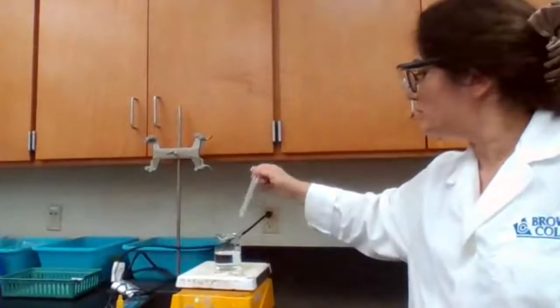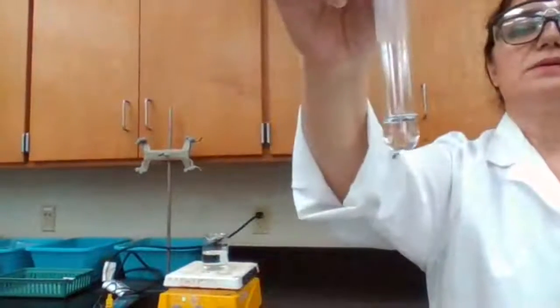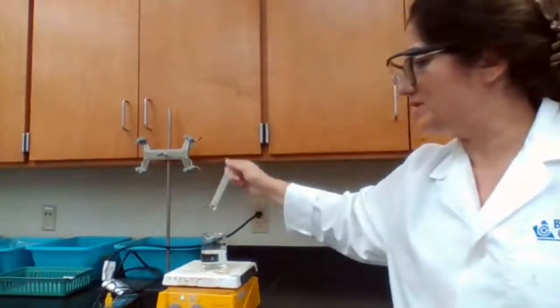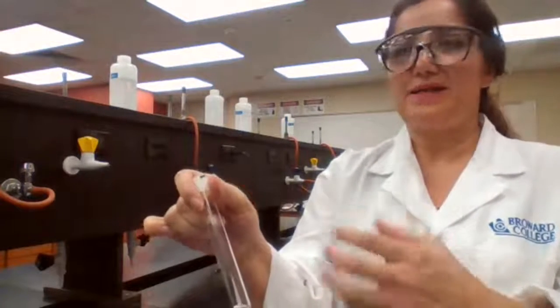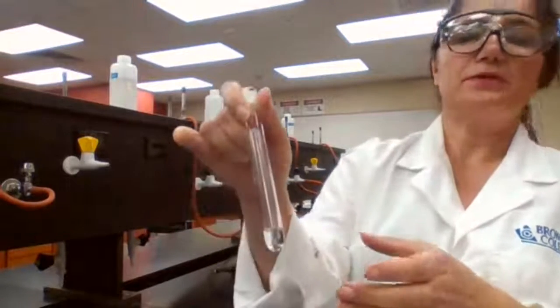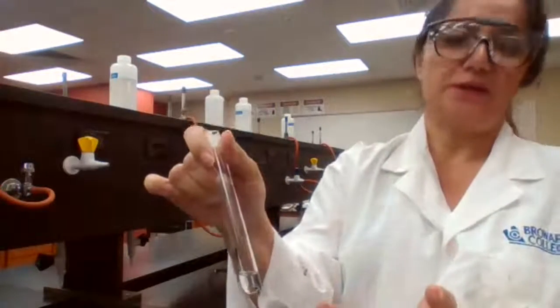it changed to a clear solution. So in the hot water bath, it changed to a clear solution, and in the ice bath, you saw the precipitate. It formed crystals. So dissolving ammonium chloride in water, you can then decide based on the observation at these two different temperatures whether this is an exothermic or endothermic reaction.